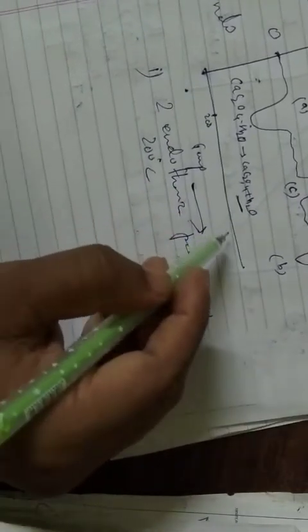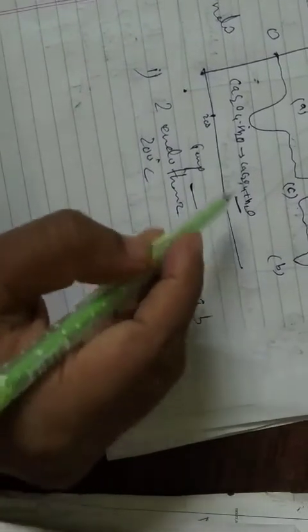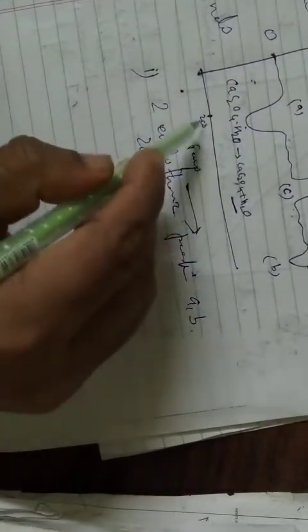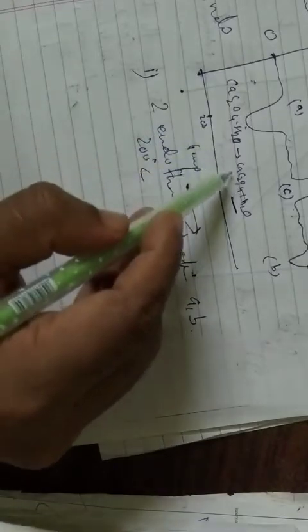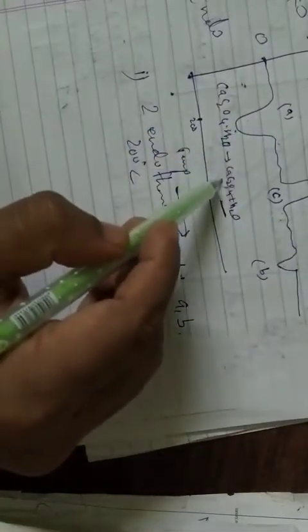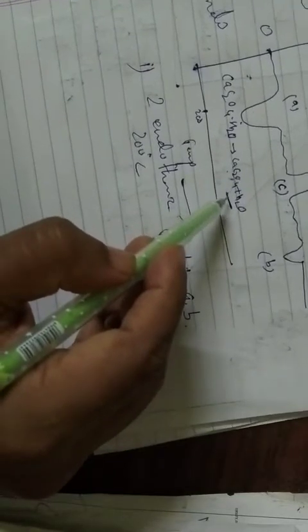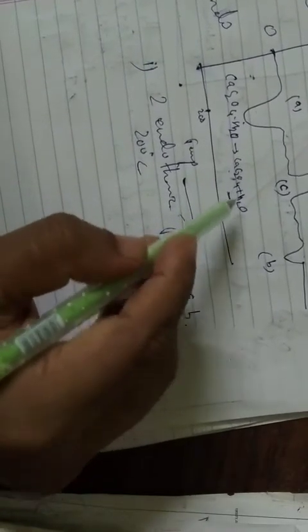This is very important: in the A case, above 100 degrees, around 200, calcium oxalate monohydrate converts into calcium oxalate, and the water is lost. This is what we observe in A.